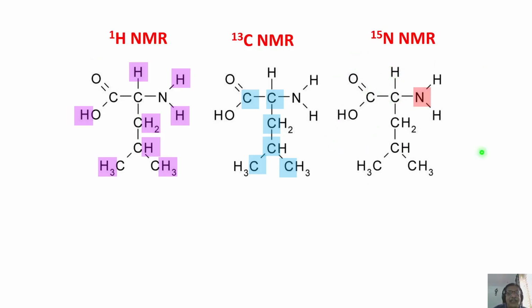So essentially, depending upon the molecule of your interest and the type of NMR active nuclei present, how many different NMR active nuclei are present, you can study that type of NMR spectrum, start the analysis by assignment of the peaks, getting the structural information. First you get spectral information like chemical shift, coupling constant, etc. And I will tell you as we go ahead later, you can use this information to get the structure, conformation, dynamics of these molecules.